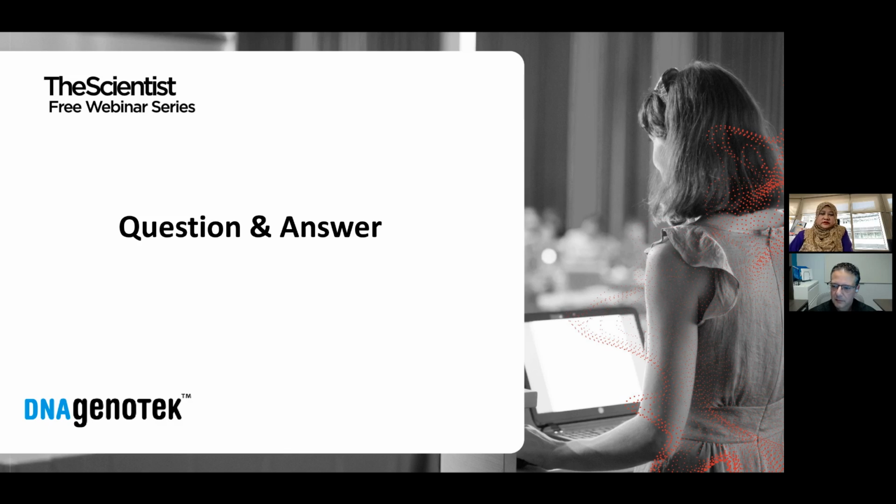The same also with the patients in the hospital. The advantage of using the saliva swab or saliva sample is that if a patient has already had a recent blood transfusion, it's quite difficult to do their HLA test. So we recommend them to use the saliva or saliva swab for the HLA test. This is from our experience.